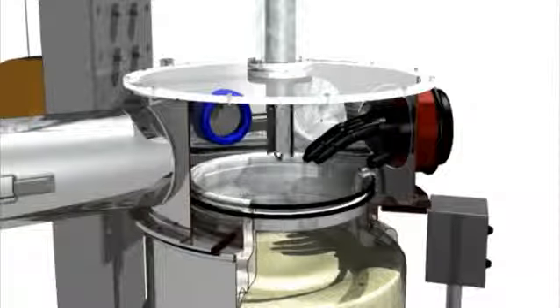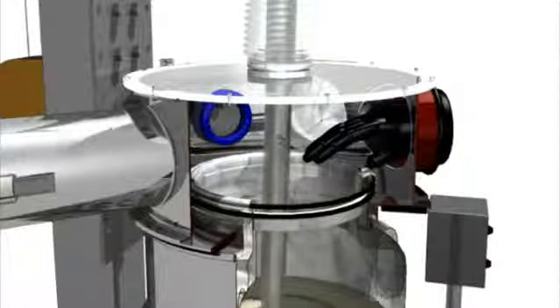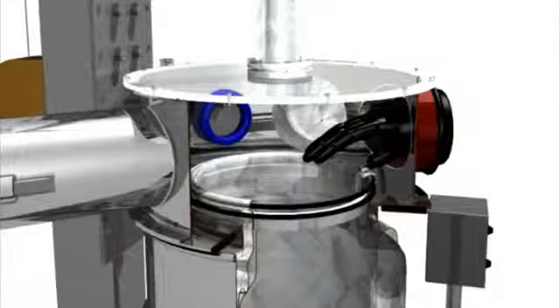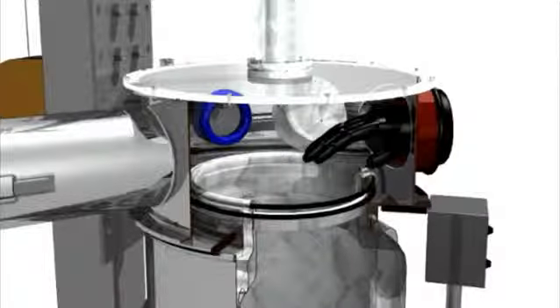The operator can then move to the outside of the system and use the suction lance, which is connected to a PTS, to remove product from the bag. Once the drum is empty, the operator simply reverses the connection sequence.